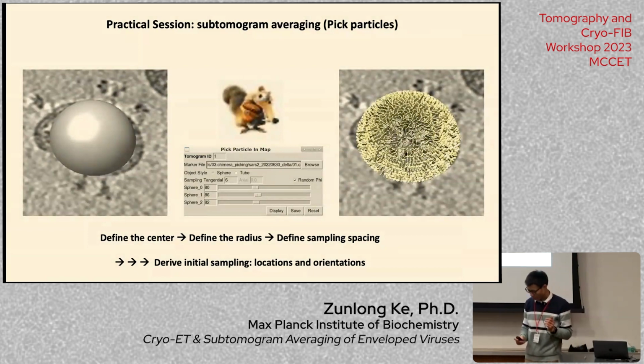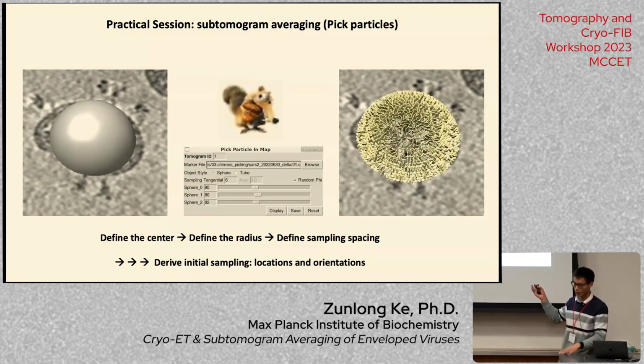Right. So obviously, this is way more than I should sample. But let's say, assuming I only have 2 spikes on the surface and I sample, let's say 200, how am I going to clean that afterwards? Essentially, I treat each position as a sub-tomogram, and I align to the reference, allowing it to shift as much as it needs to go to the true spike. What happens after iterative refinement or alignment is that there's a spike here, and the one next to it will essentially go to here if your alignment parameters are right. They will go here. So you will get a cluster of, let's say, 5 points at that single position, clustered super tightly.